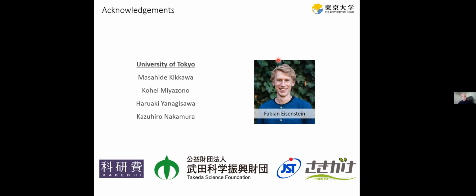Yeah, surprisingly, they are not that detrimental. When I compare the objective lens aperture versus no aperture, the aperture dataset, which used the 100 micron objective lens aperture, didn't have any spots. Basically, as long as you're not collecting very close to the edge, you don't see the spots if you put the aperture in. Of course, be very careful to center the aperture well, because otherwise it can introduce terrible astigmatism or higher order aberration. Apart from that, even some of the datasets that reach sub 2 angstrom were collected without an aperture, and you would see these spots there.